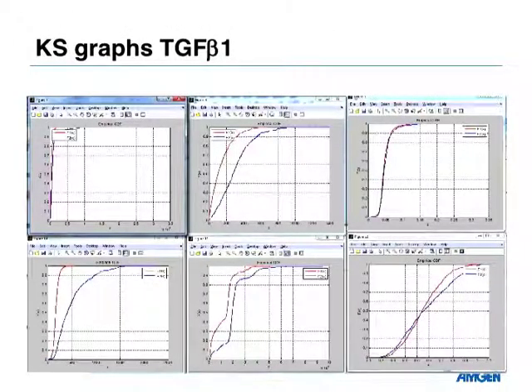When we look at something like these cells treated with TGF-beta, you can see that some parameters don't really change at all and some are very different. In this case, looking at this measure, our treated population becomes very small, whereas the normal untreated population is fairly far over here. One of the nice things about KS statistics is that you could use different populations for whatever you're comparing. If you want to find something that looks like some particular treatment, you could use that as your control population and compare everything against it to see if things are very similar or very different.